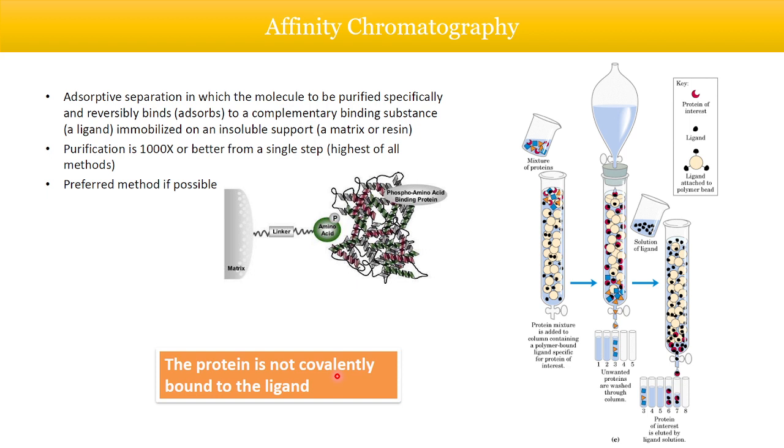So this is about the chromatographic techniques that we use for the separation of proteins from a mixture of cell organelles and the cell homogenate.